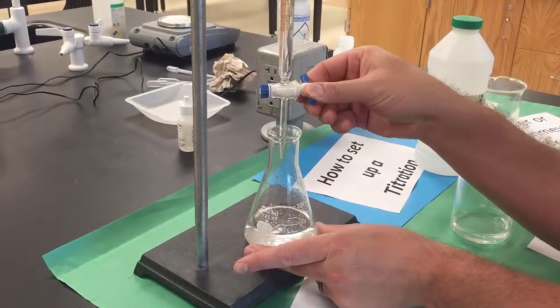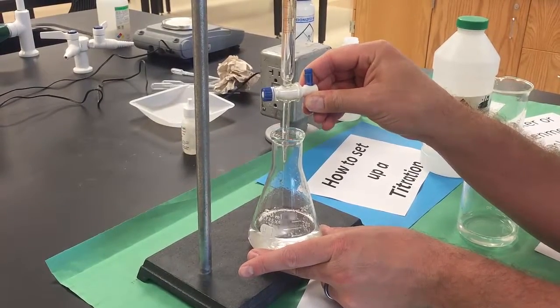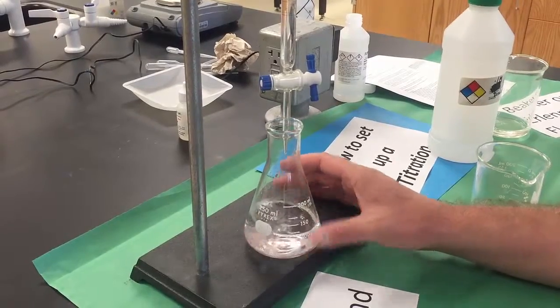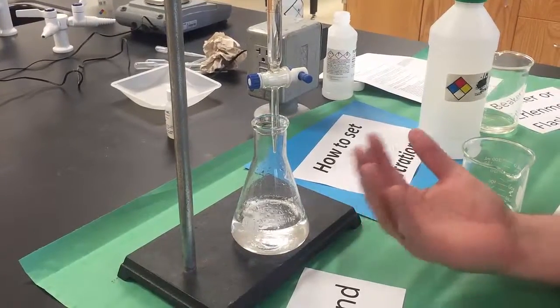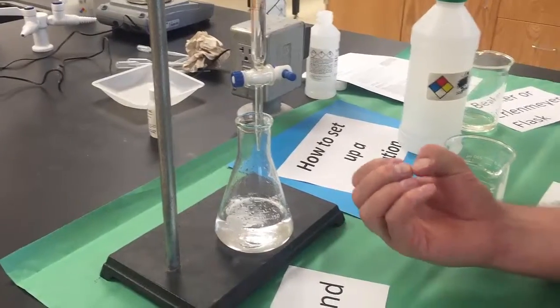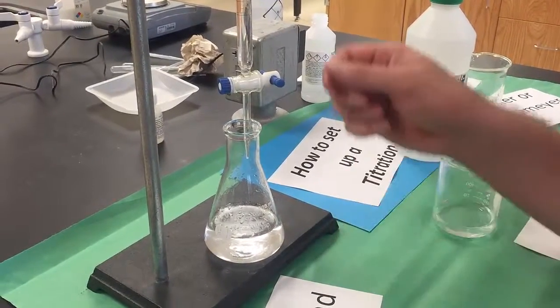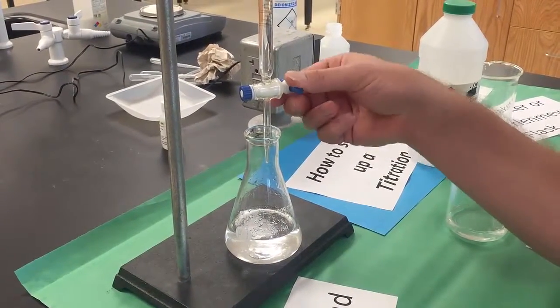If I open the stopcock here and sodium hydroxide starts to enter the solution, you can see right away that it's starting to turn pink. That's because of the instantaneous reaction of the sodium hydroxide with the KHP and the phenolphthalein, you'll get that pink color. What we want to do is, at the moment where this just starts to turn pink, that's the point where you've neutralized all the KHP. So the trick is getting it to that point. You don't want to go over.